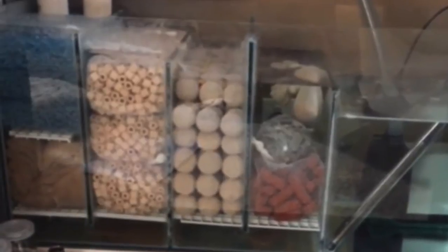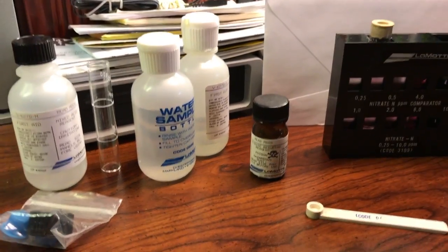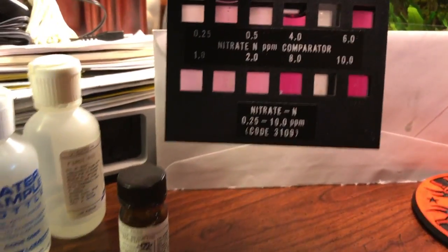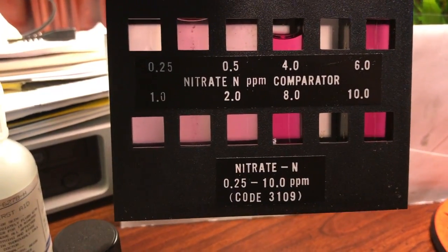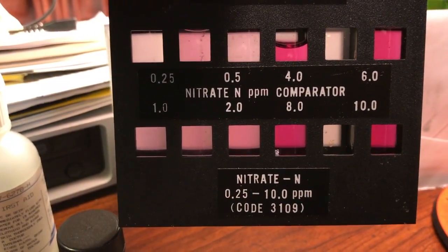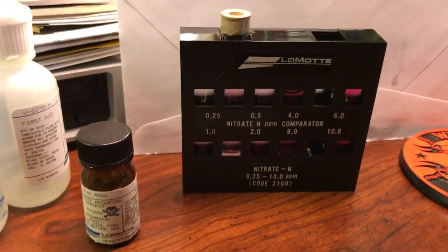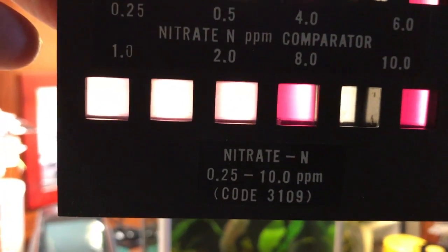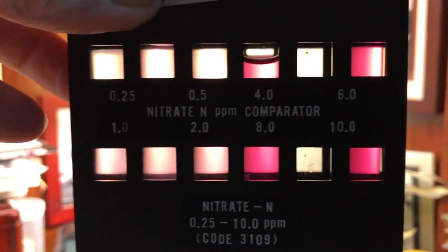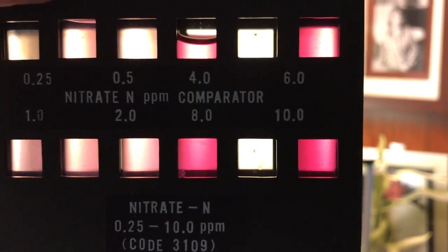Could you imagine looking at this sump — you've seen pictures of how my sump is — could you imagine trying to clean that? Unbelievable. Anyhow, this is a Lamotte test kit. If someone comes to your house, this is a professional test kit. They're extremely expensive. I've had DVMs come to my house and literally pull out Lamotte's — this is what a lab is going to use.